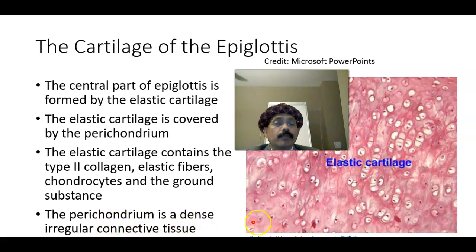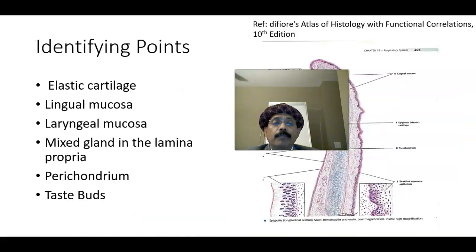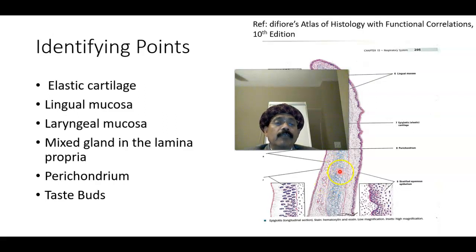The perichondrium is not shown here, but in our previous image we have seen the perichondrium. This is the perichondrium — this is a dense irregular connective tissue — and the elastic fibers are inserted there.